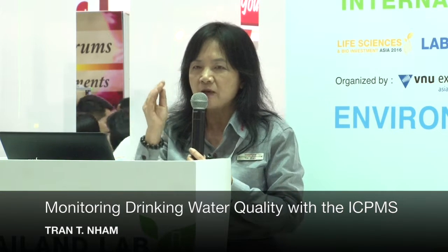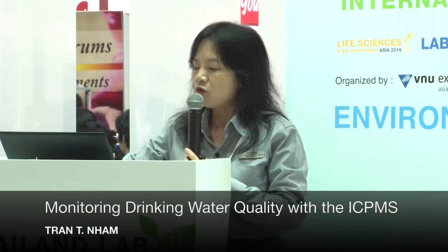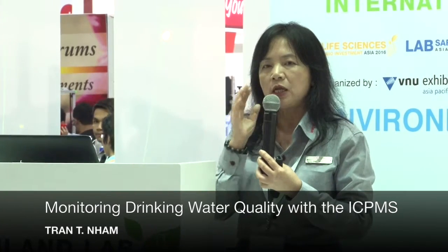And why is it called ICP-MS? Because we are dealing with the mass. So we are talking about atomic mass. Right. You look at the periodic table, there are many elements. For example, if I choose nickel and obtain the nickel mass spectrum, you can see there are 5 different peaks, because nickel has 5 different stable isotopes. Each signal represents an isotope. So nickel has atomic masses of 58, 60, 61, 62, and 64.